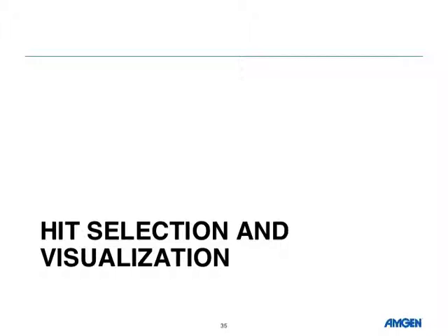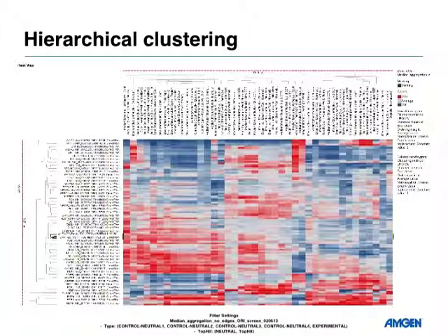So we have the ability to produce thousands of data points per well and per cell. The question is how to figure out which things you want to look at. Here is an example of hierarchical clustering. We've taken all those single-cell measurements and created well-based averages for those treatments. On the y-axis you have the different compounds, and on the x-axis the different things that we've measured.